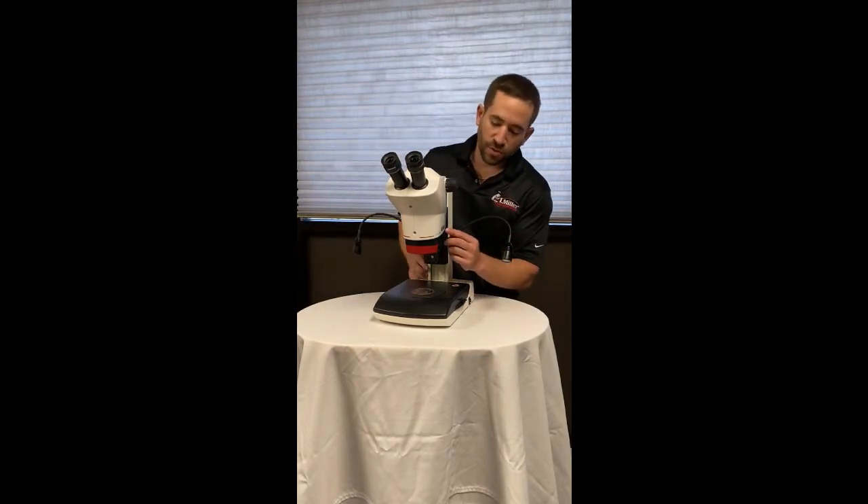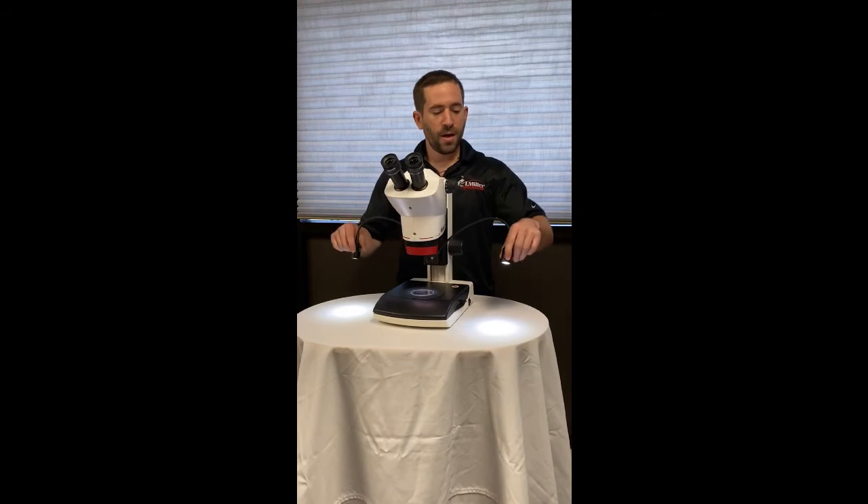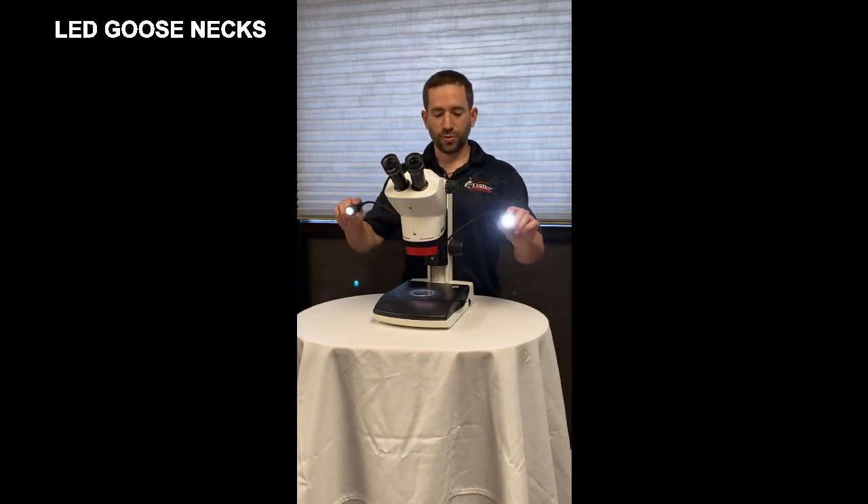The versatile illumination options include a built-in LED segmentable and variable ring light and two LED variable dual gooseneck illuminators.